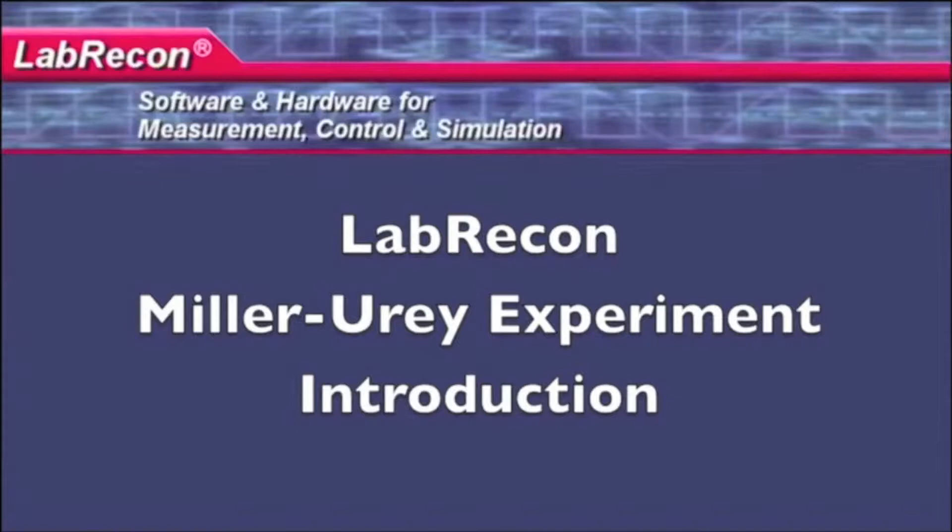This is the first time ever that this experiment will be performed giving anyone the chance to participate in creating life.